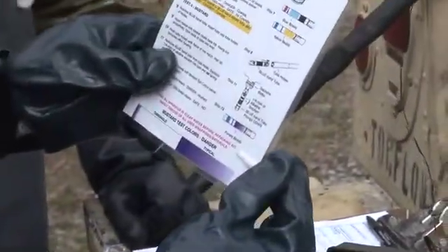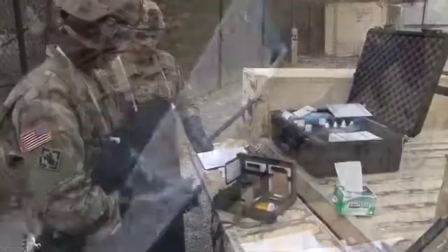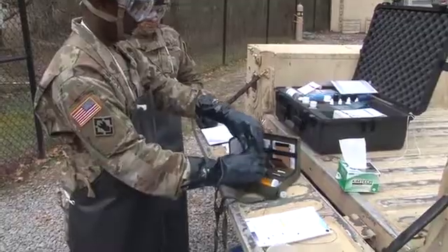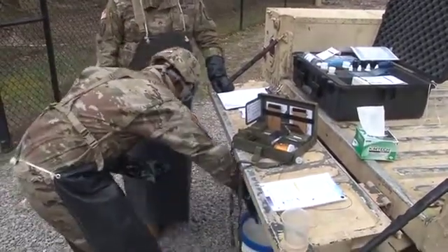If you do find an indication of mustard, be sure to report the results to your supervisor or commanding officer according to standard operating procedures. Well done, water dogs. You'll finish up this segment by rinsing your test hardware in clean water.